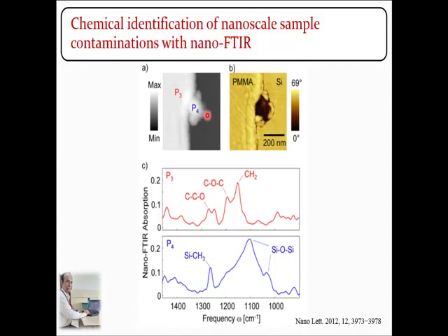Each phase contrast indicates different materials. Without prior knowledge, however, we cannot identify the particle-like feature of about 100 nanometer diameter.